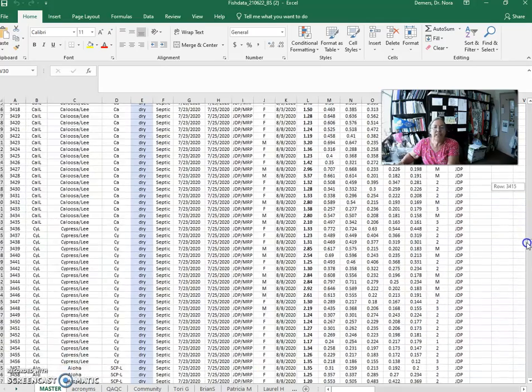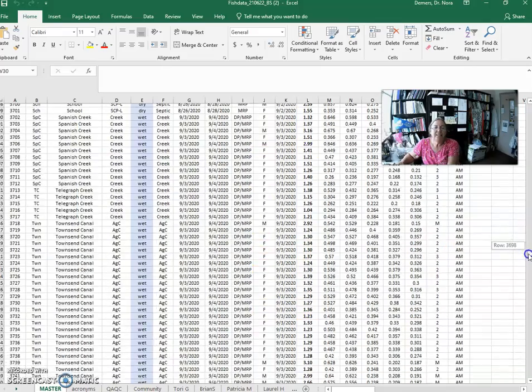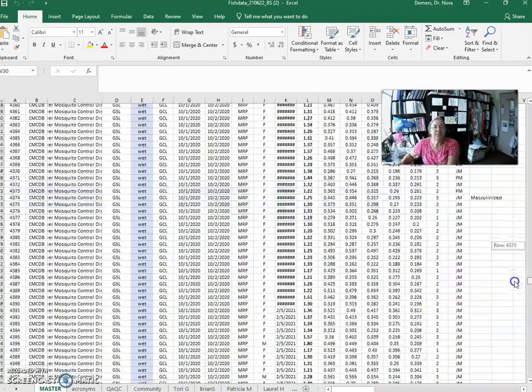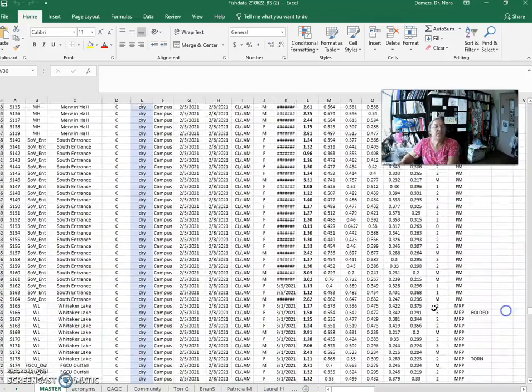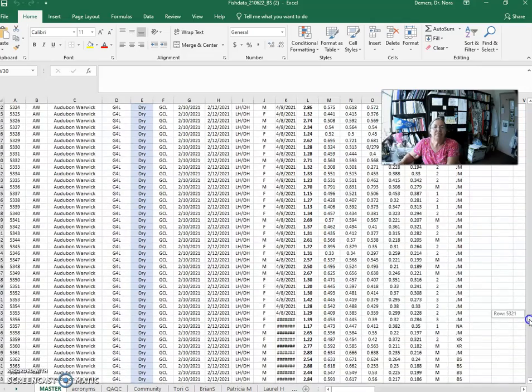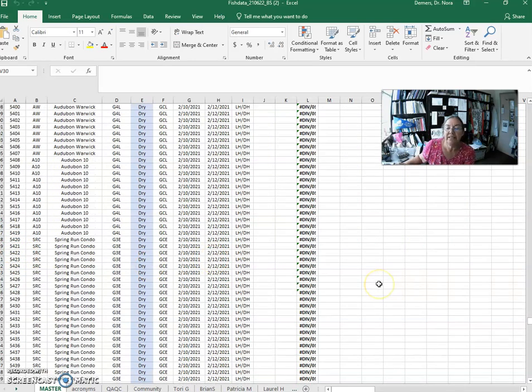We're down around 3,000 fish now, which is in July of 2020. August, September, October, November, 4,000. January, we're up around 5,000. Here's a block of them that haven't been measured yet. So you have to come back and find this fish and start adding those measurements in.